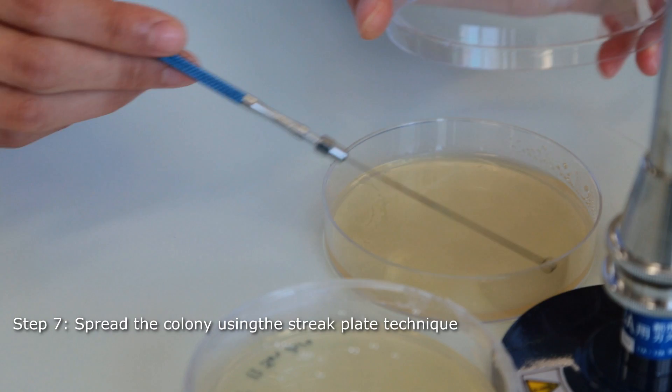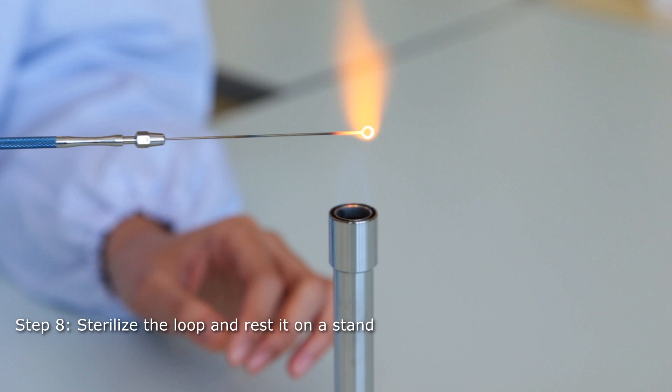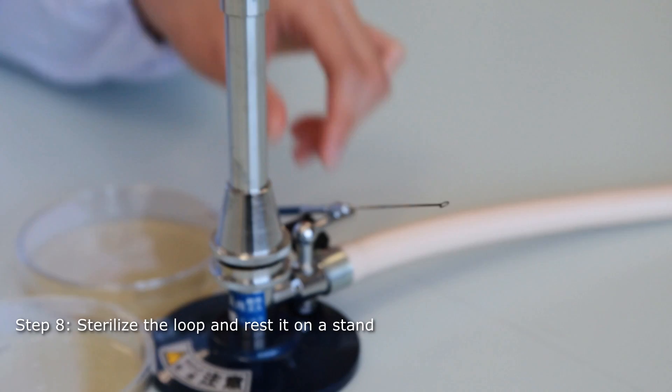Here is a visualization of the streaking made using a marker. Sterilize your loop using the flame. Watch out for projections due to boiling of remaining material on your loop. Remember that you should wear protective eyewear whenever using a Bunsen burner.